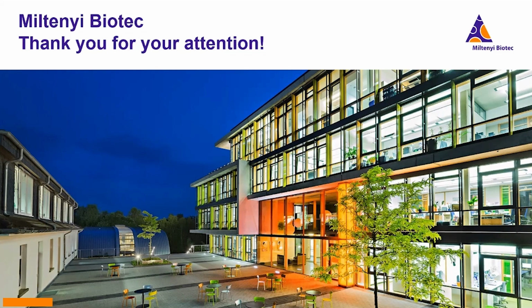Okay. And I think the last FFPE question we have at the moment, although if you still have an FFPE question, please go ahead and ask it. You still have time. What is the difference compared to the old FFPE TDK?